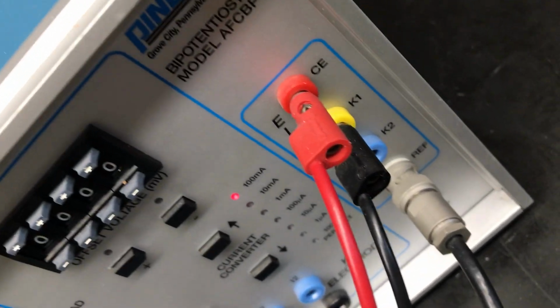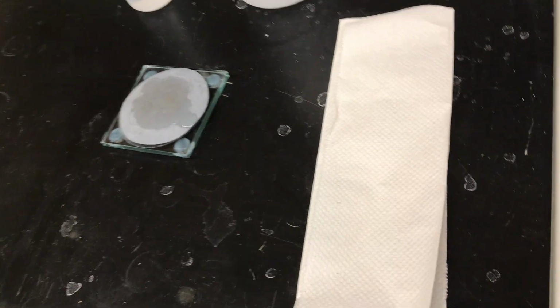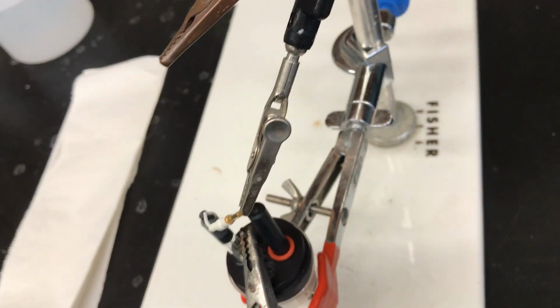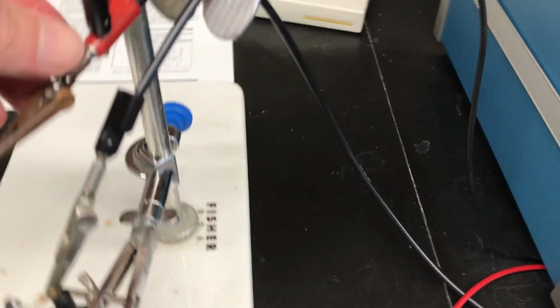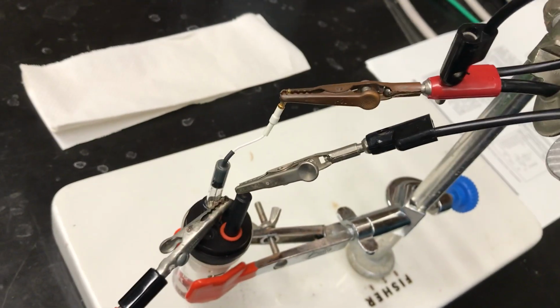Now, the black cable comes back to the K1 electrode, which is the working electrode. So the working electrode, of course, is going to be the carbon disc electrode here. So I've actually brought my alligator clip in and hooked into that. And then the final electrode here is the silver chloride reference electrode. So I'm going to come in and make my connection there to this final alligator clip here, and I'll show you momentarily what the whole thing looks like. Okay, so there's the whole electrode assembly all hooked up.